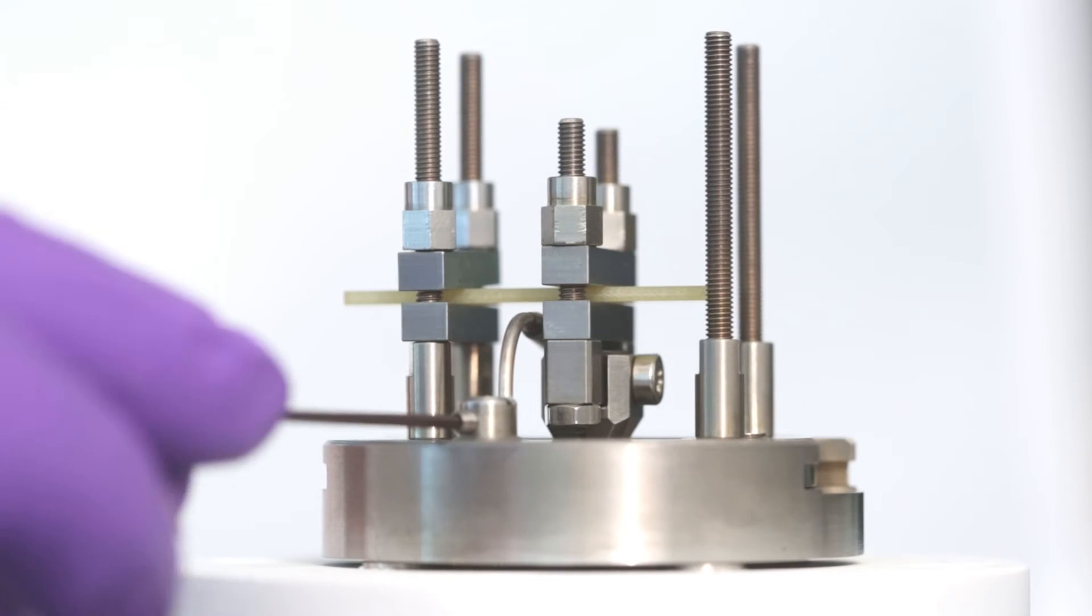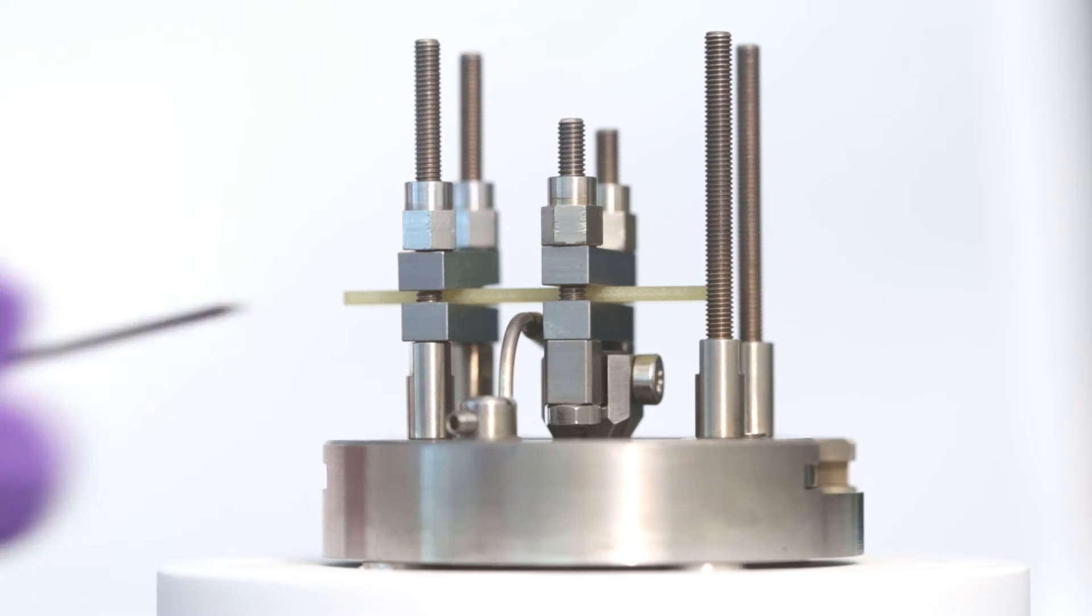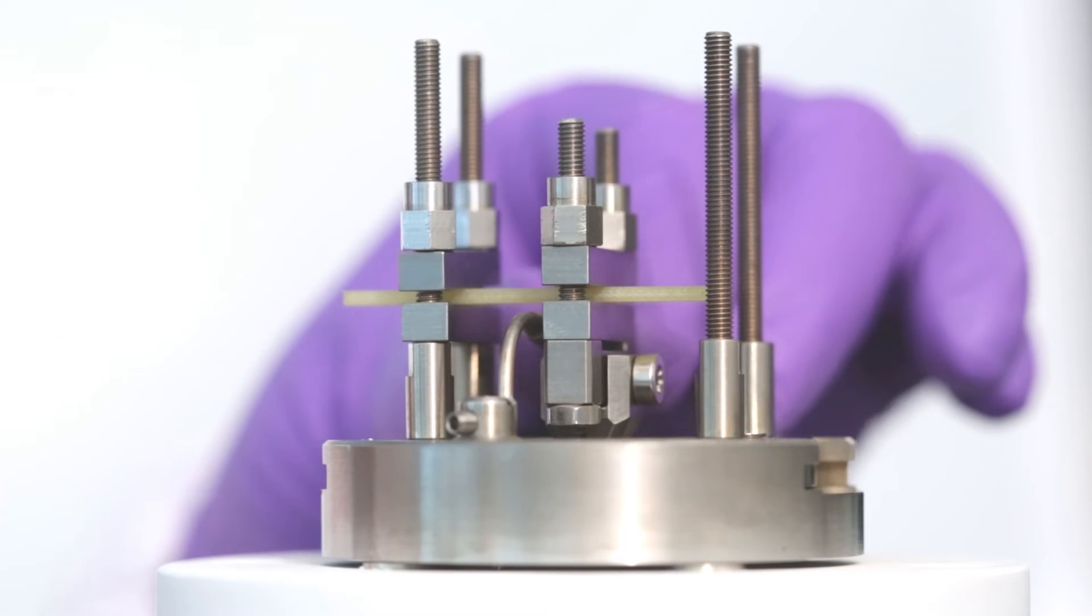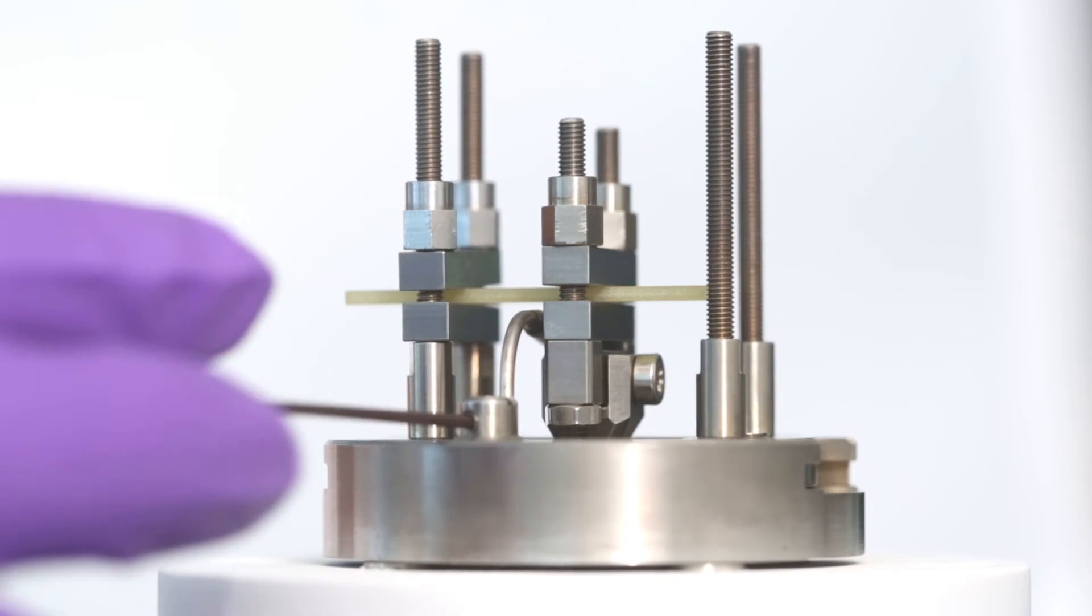Loosen the securing screw of the temperature sensor with a 1.27 mm Allen key. Position the temperature sensor as close as possible to the sample without touching it. Then, tighten the securing screw.